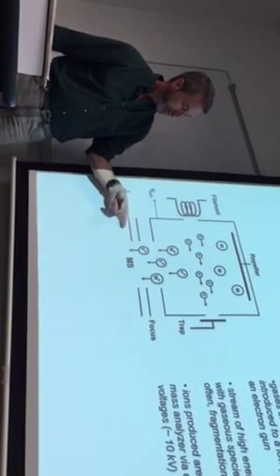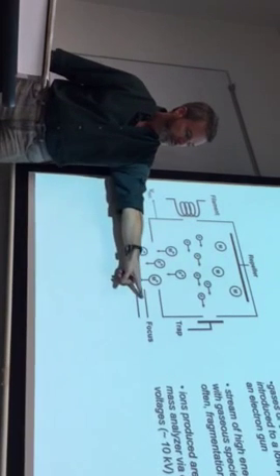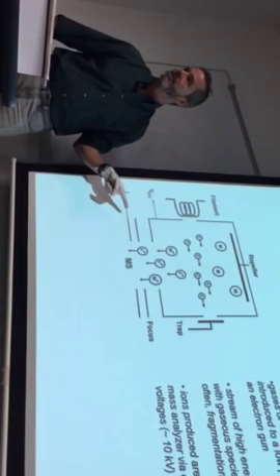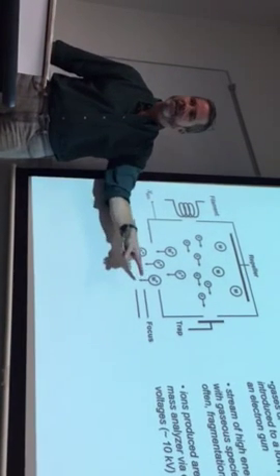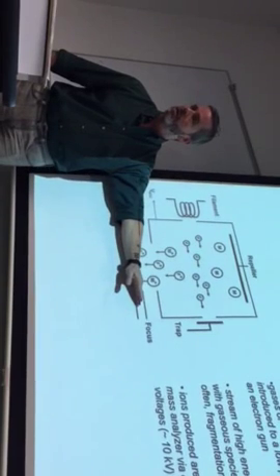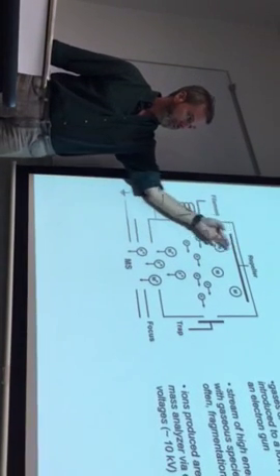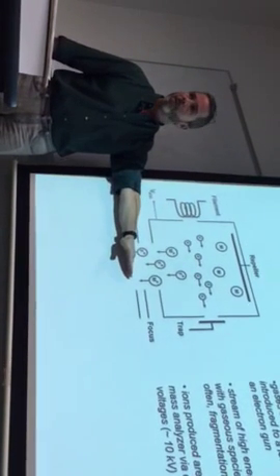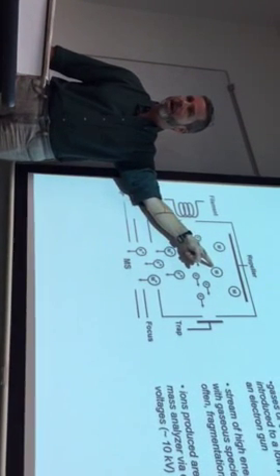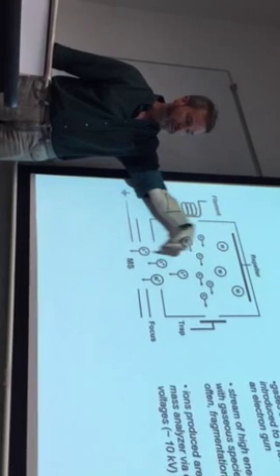And down at the bottom of this figure, focusing lenses, electro-optic lenses. It's sort of like an exit slit. You can think of it that way, because that is where the ions exit, held at a high negative potential. So there is an electric field, positive up top, negative down bottom, serving to accelerate the cations that are formed downward.